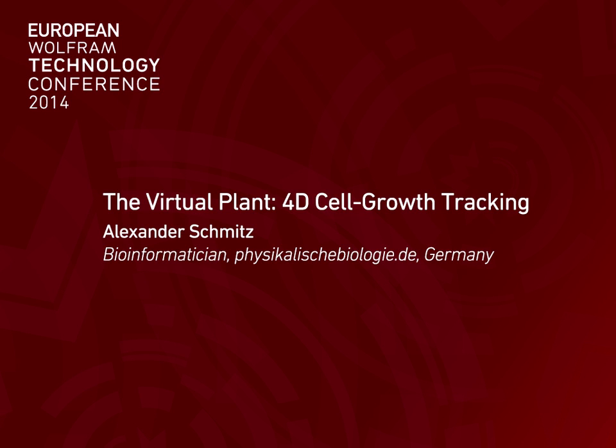I work in a group called the Physical Biology Group, and our group consists of a quite diverse set of people. We are biologists, chemists, physicists, we also have mathematicians, and also me as a bioinformatician. In our group we try to combine several aspects of cell and developmental biology together with 3D time-lapse microscopy. If you have heard the talk by Ernst Stelzer, you might know a little bit about that now. We also do data processing in our group and mathematical modeling.